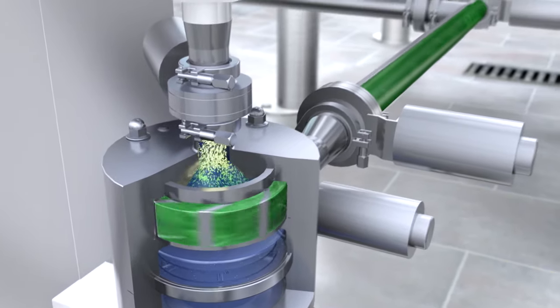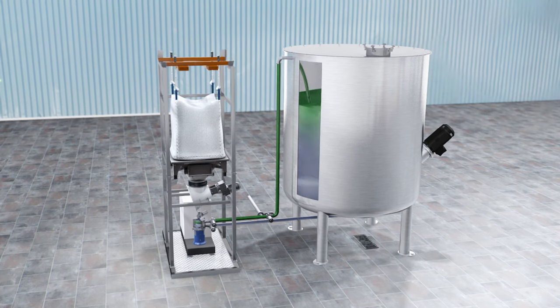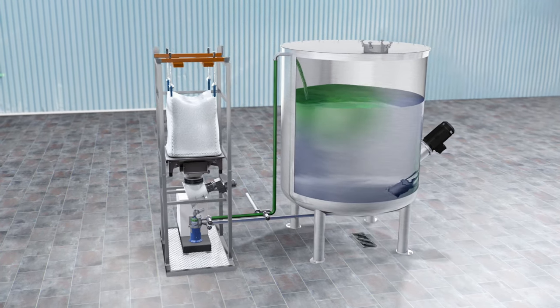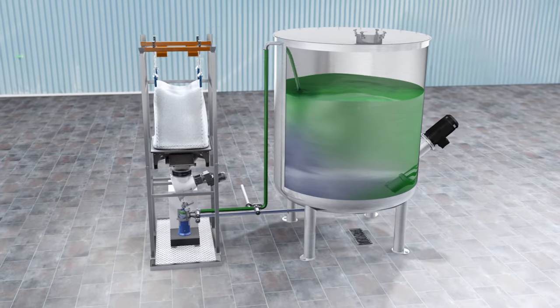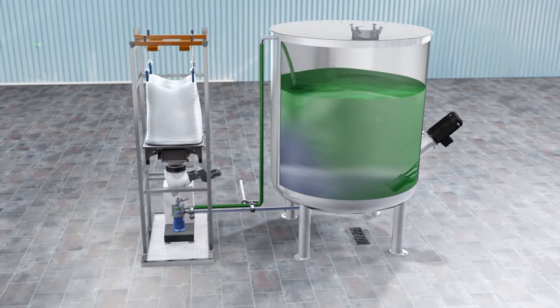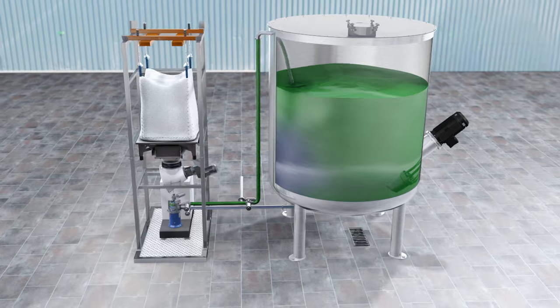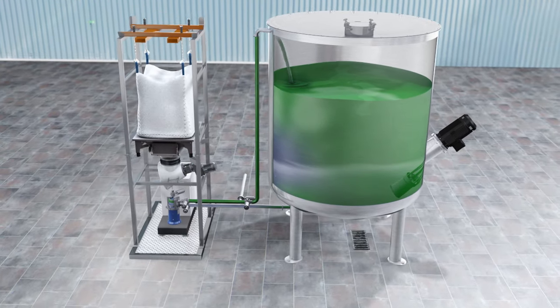The mixed product is then pumped back into the vessel. Even if the product becomes more viscous, the fluid throughput will remain high. The system processes products with a wide range of viscosities, without the need for additional equipment, such as circulating pumps.